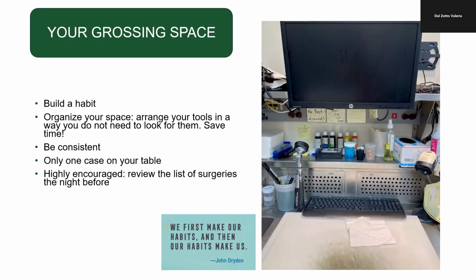That clip means a biopsy with a diagnosis, and the radiologist and the oncologist will need to know which clip correlates with the cancer and which ones do not. So you are going to need to review the clinical information and the imaging before the day starts.